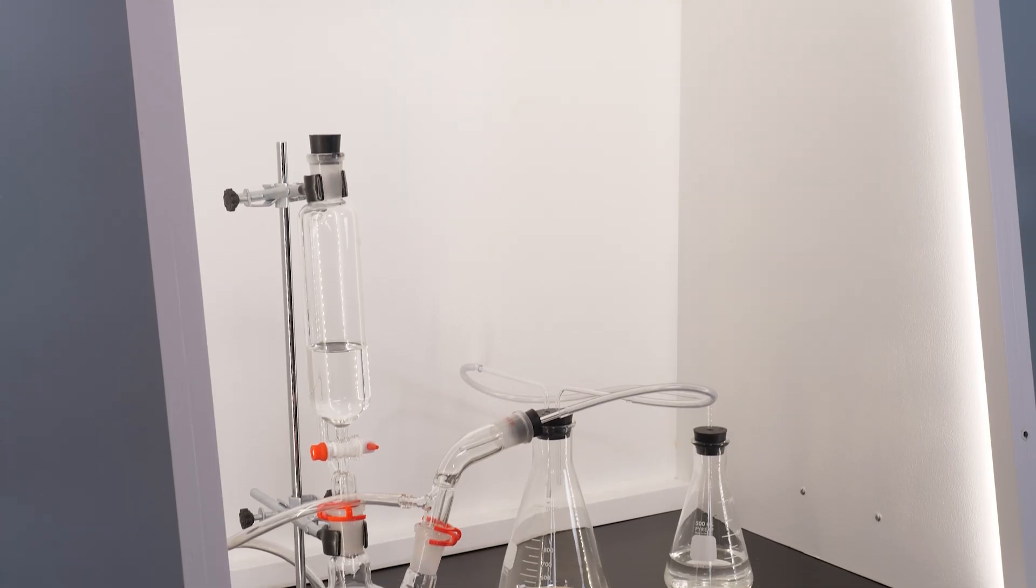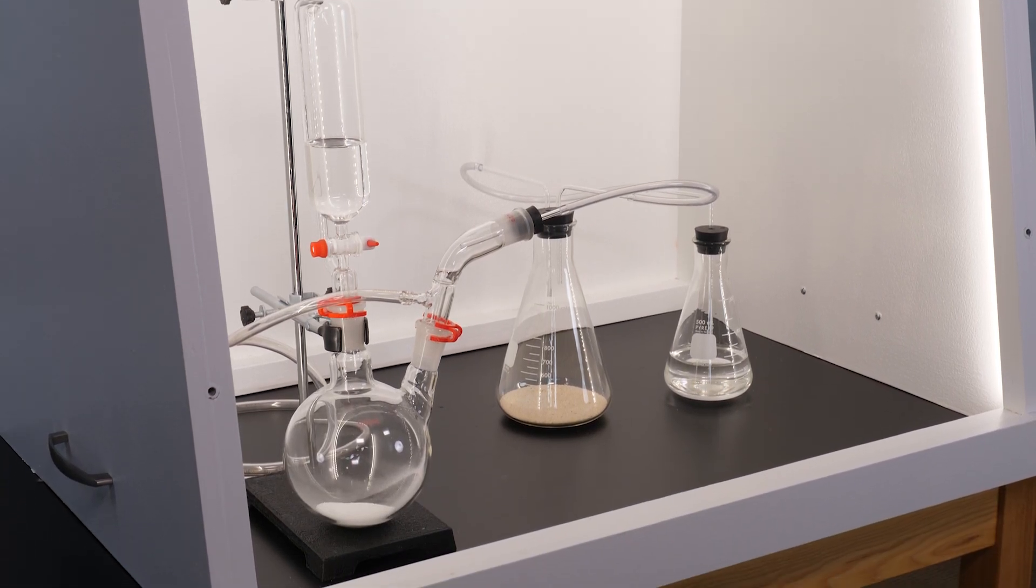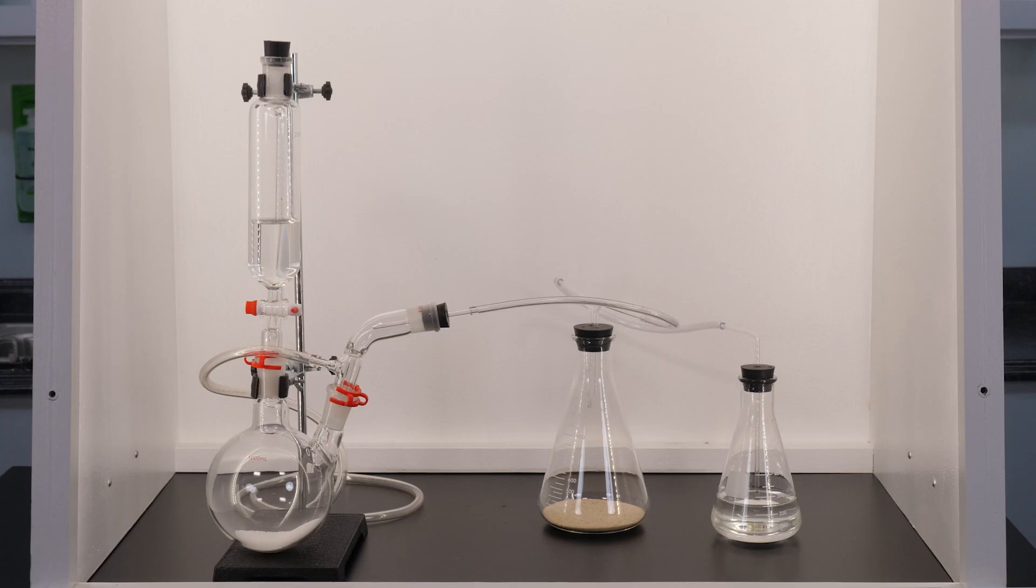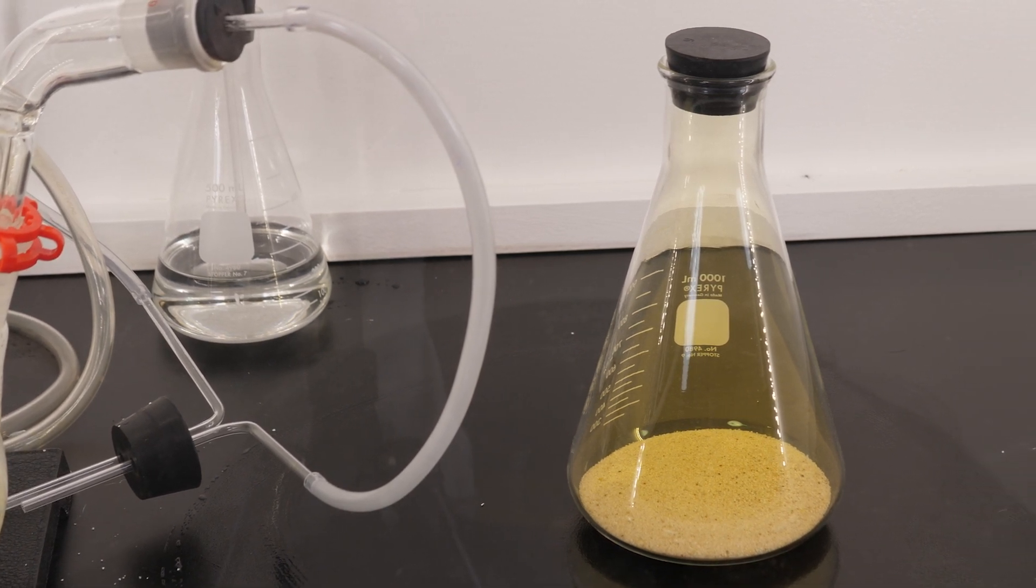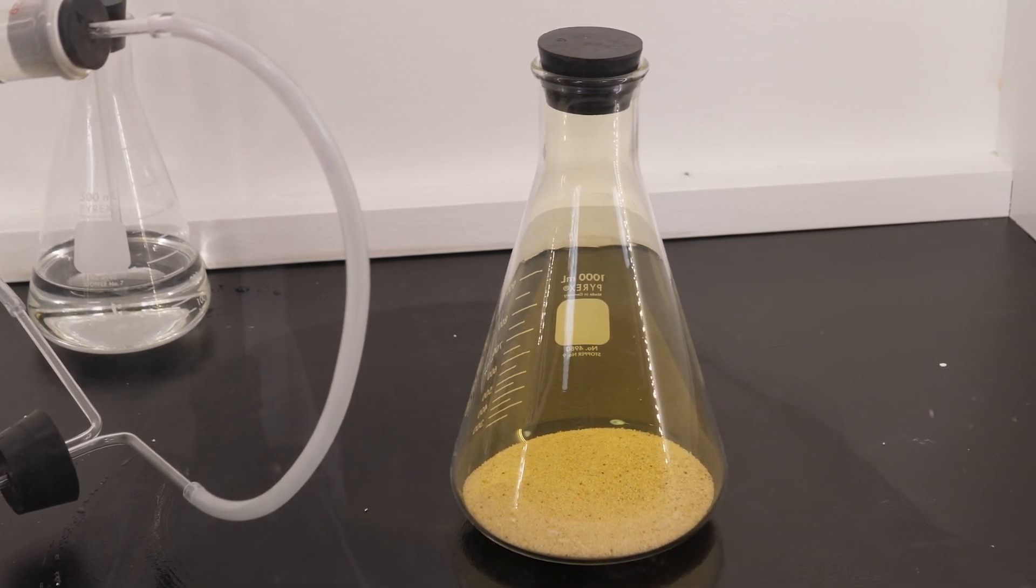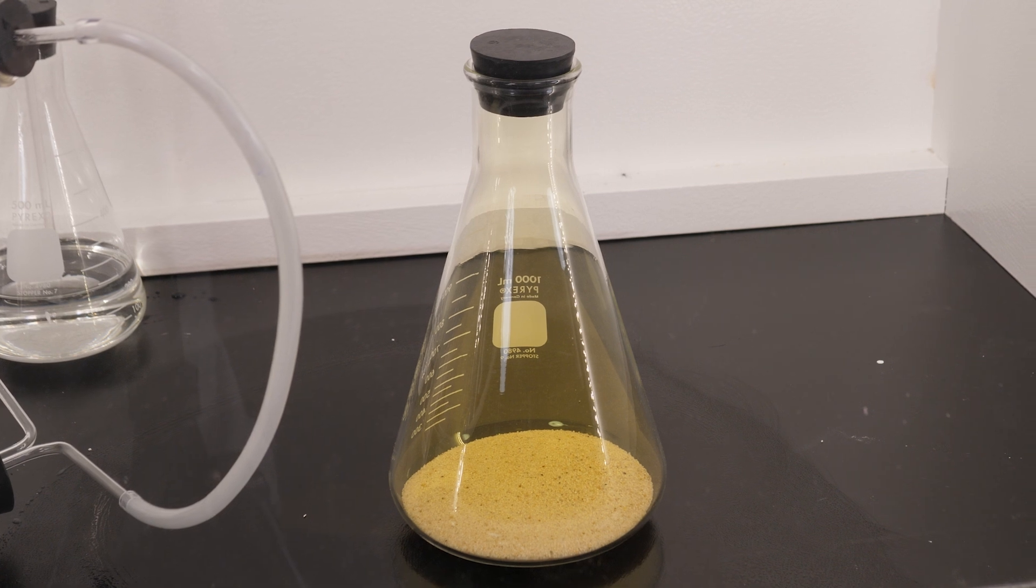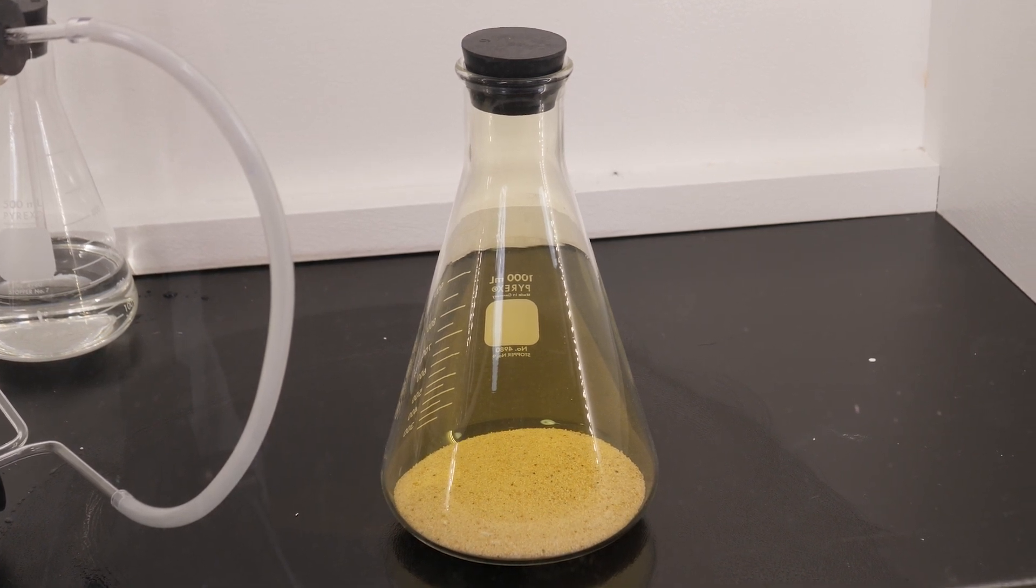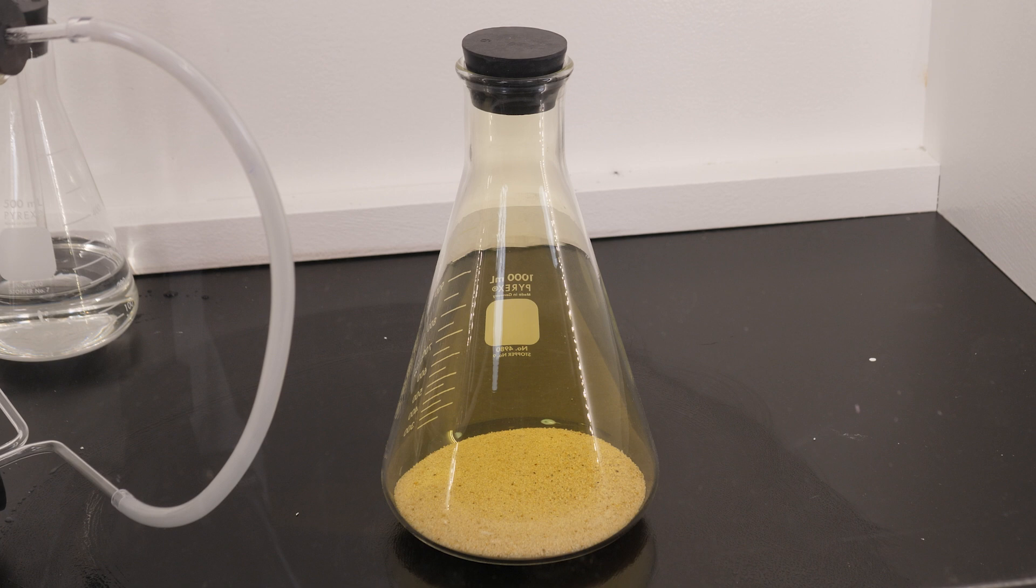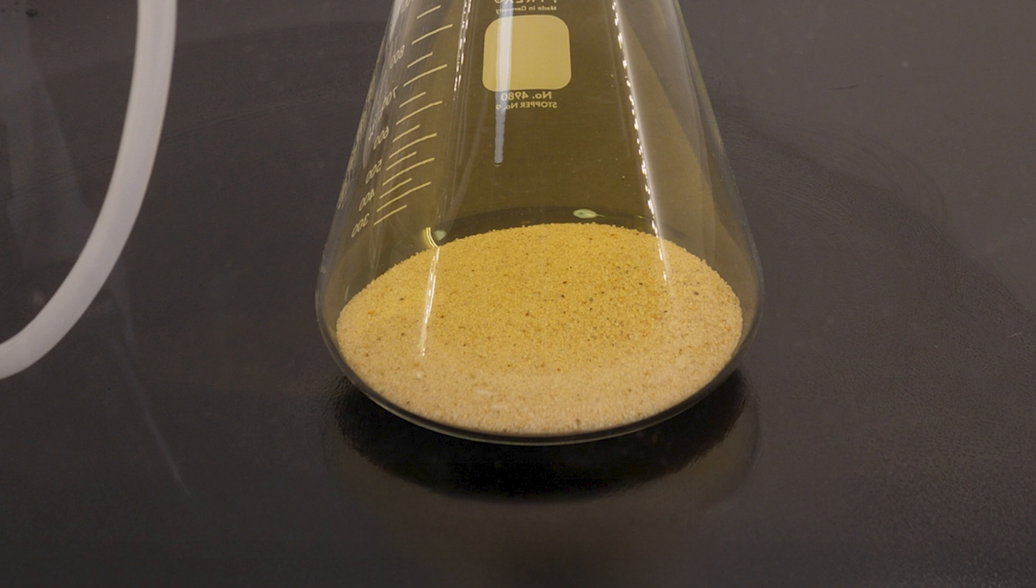This is a sealed system to prevent the chlorine gas from escaping. However, any time you are working with toxic or potentially dangerous chemicals, the experiment should be performed under a fume hood. Using our chlorine generator, we collected 1,000 milliliters of chlorine gas in this Erlenmeyer flask. This gas will be used to react with sodium to produce sodium chloride.